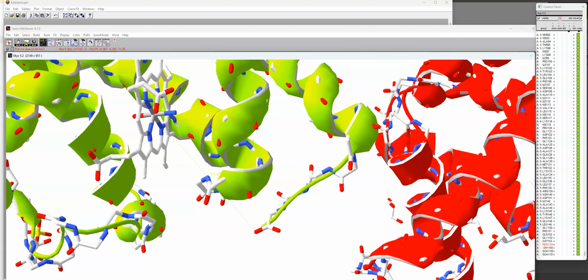Okay, now I want the exact same. So that was for the 5.2. I'm going to jot that down. I'm going to write down in my 5.8 column, right? I'm creating two columns, one for the 5.8 and one for the 5.2 and the 6.8. So I got the 5.2, and I'm going to jot that down. I got a distance of 14.18, and that's angstroms.